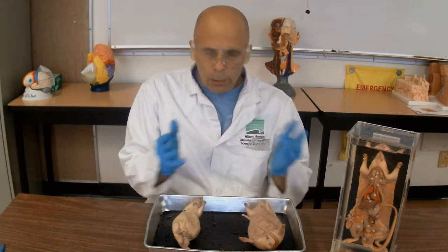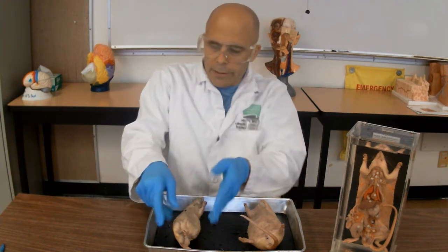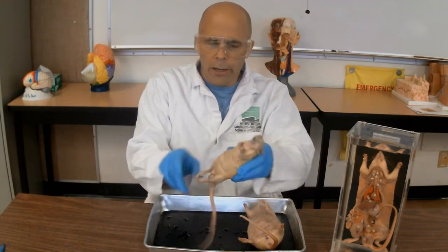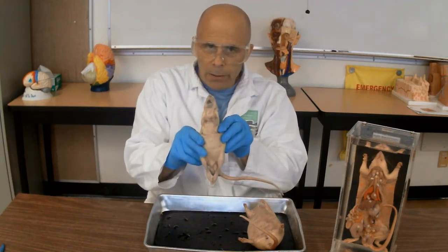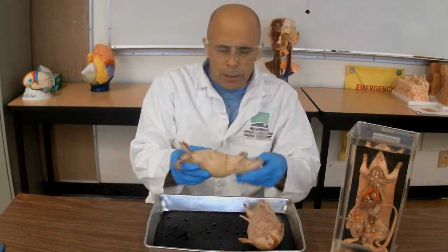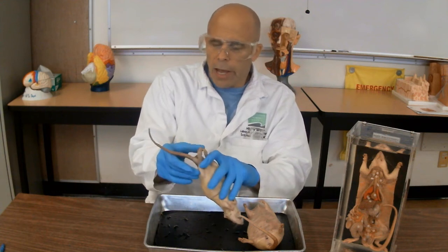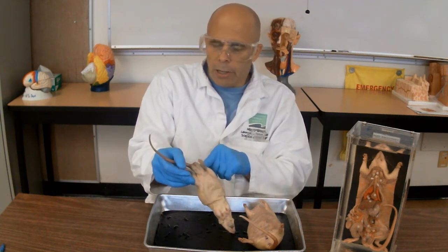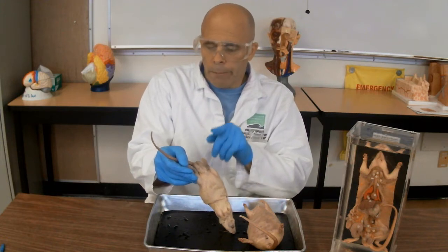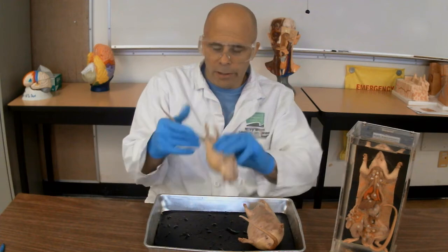Let's look at the external anatomy of these two animals, starting with the small one. Male or female? Everyone thinks males are bigger generally, but not in this case. I can verify that this is a male rat because between the hind legs I can see reproductive structures, including the scrotum and testes. So that's a male rat.